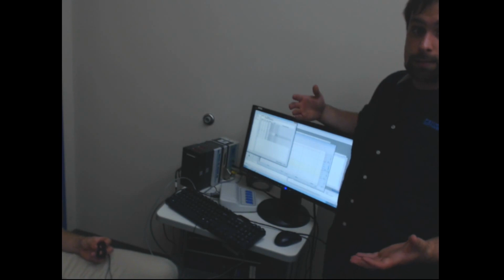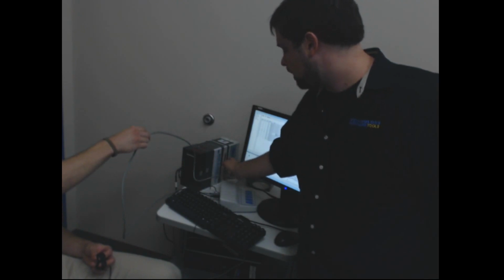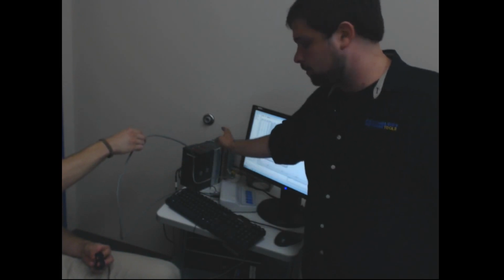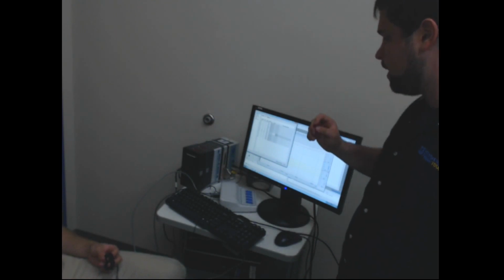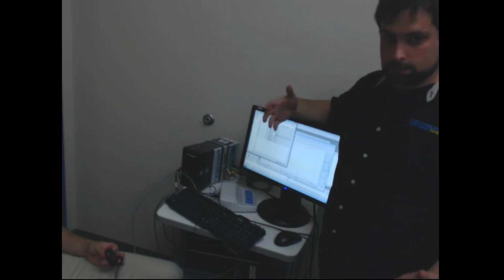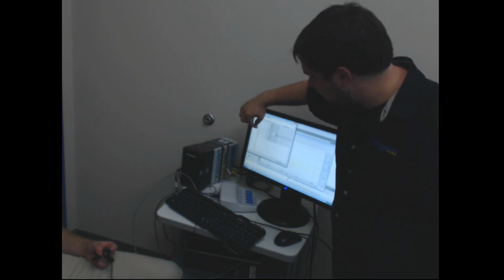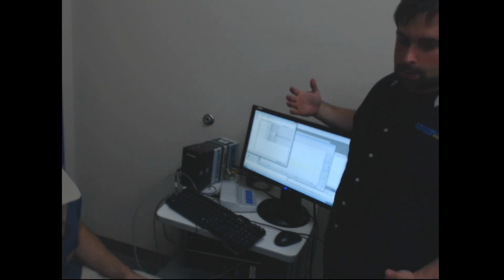coming in, since I'm doing the digital out to Kronos. And you can actually see the digital out is that cable that I showed earlier. It actually comes from Kronos' analog aux-IO port, or digital aux-IO port, and it goes right into Biopac right here to that STP100 that I talked about earlier. And as you can see, since I was using that chart earlier, everything that I write from Kronos for these 2 digital outs is actually going to come in through channel 8 and channel 9 in Kronos. Or sorry, in Biopac.